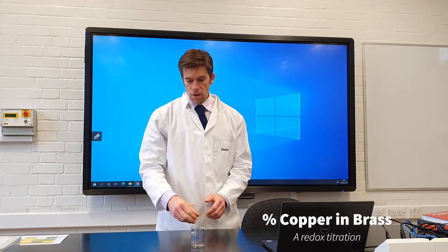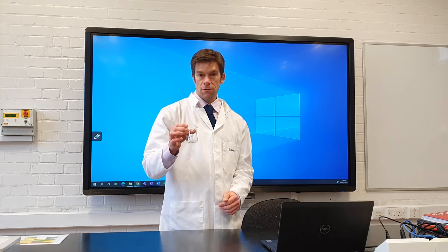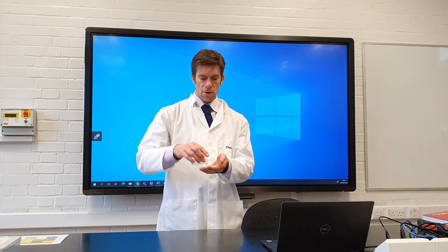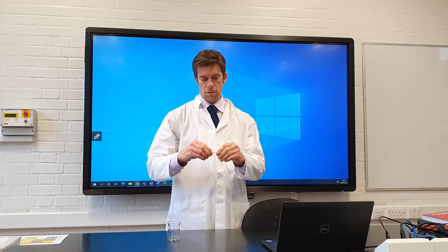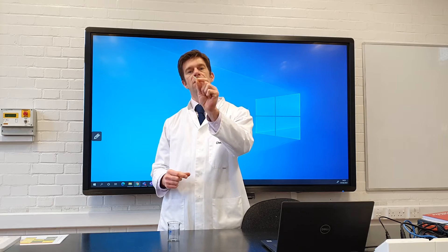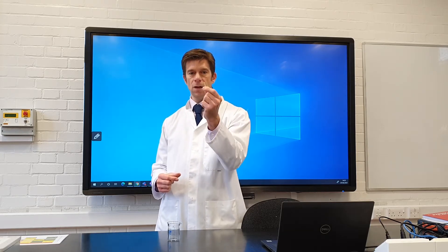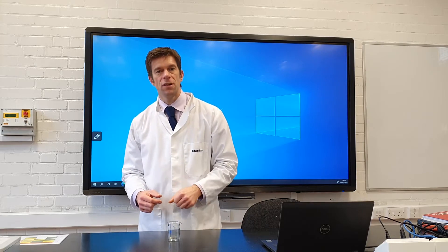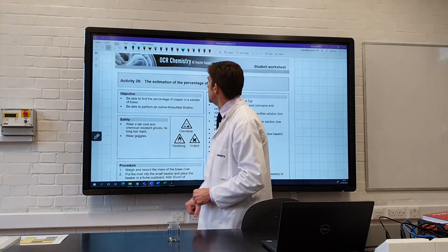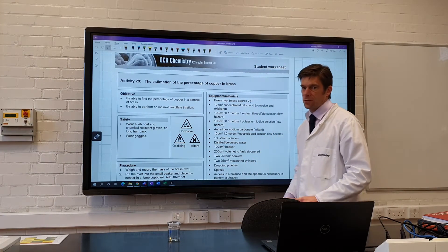Hello. I've got a brass screw here. Brass is an alloy of copper and zinc. Have you ever wondered how much copper is there in a brass screw? What percentage of this brass screw is actually made from copper? Well, that's the aim for today's experiment. Today's experiment is going to be an estimation of the percentage of copper in brass.